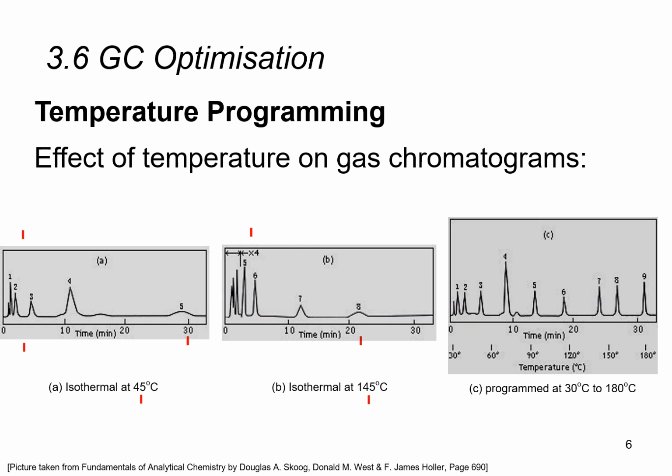So the key is that when we start off the chromatogram, we want to start off at a low temperature. So this will allow the compounds that are by nature not that well retained to give them an opportunity to slowly pass through the column and therefore interact with the column and generate separation. So this happens at low temperature.